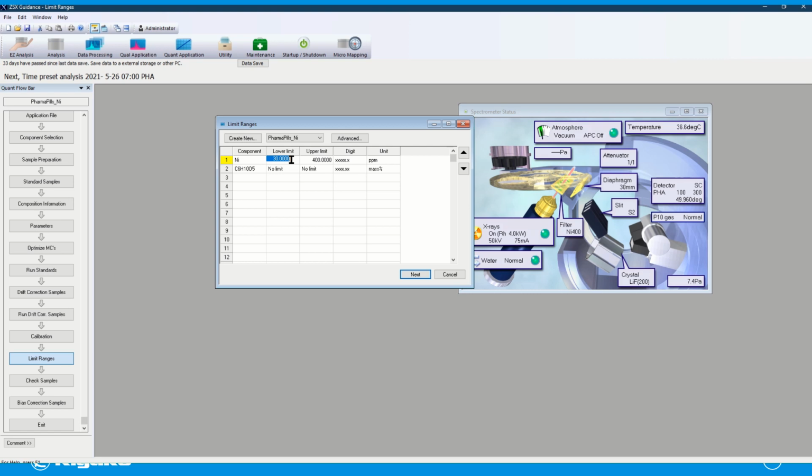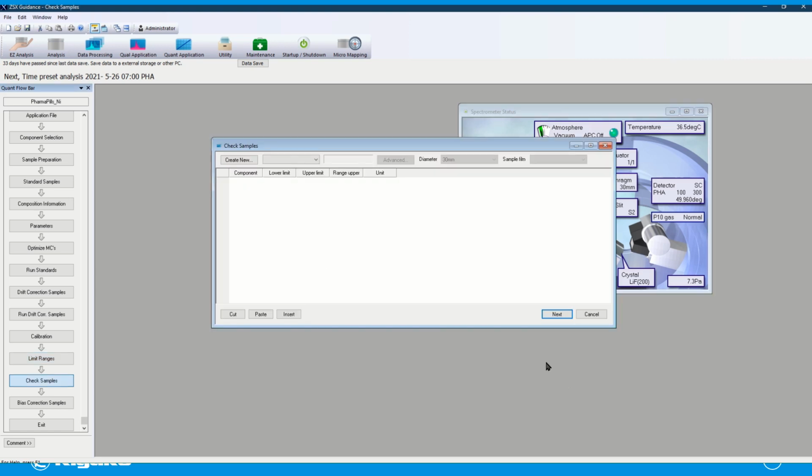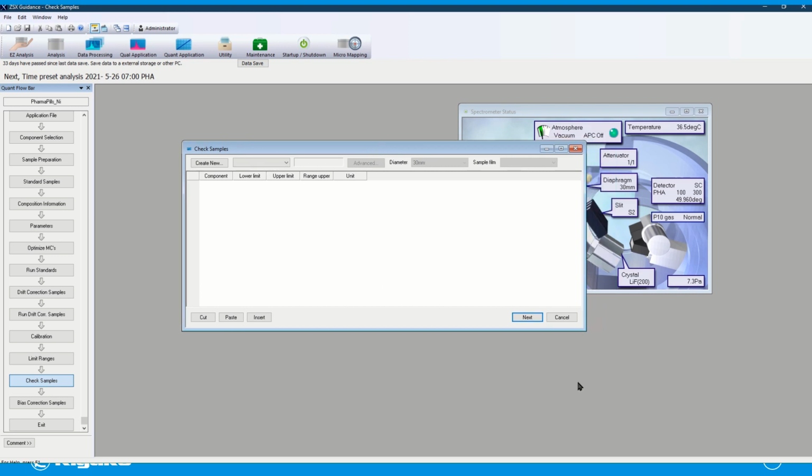So we'll do it based on our 20 ppm limit, or let's say our 0.2 J. Right. So we'll set it as 30 to 50. Okay. And then if we run our 20 ppm, it'll fail because it'll be too low. And if we were to do our 0.5 J, it'll be 100 ppm, which would be too high. Of course, you might set that just as what the ICH Q3D limits are. All right, that's it. And you have a method.